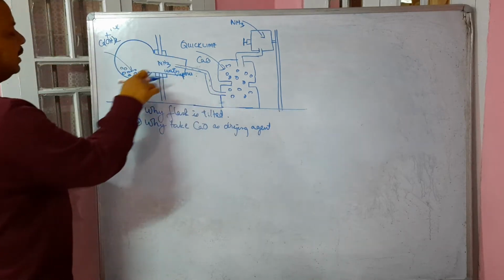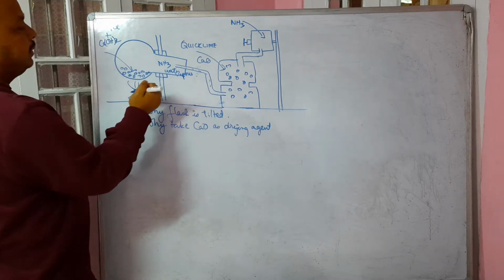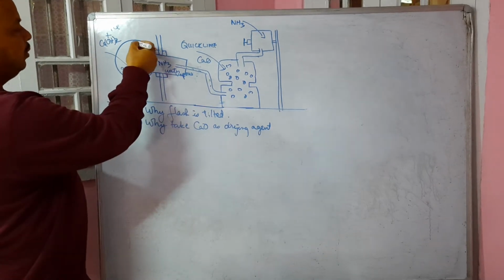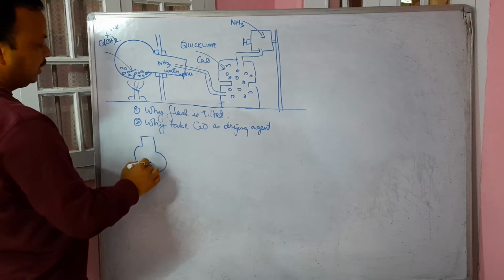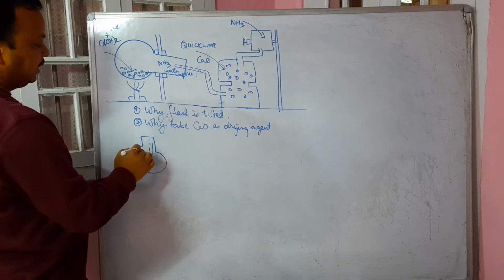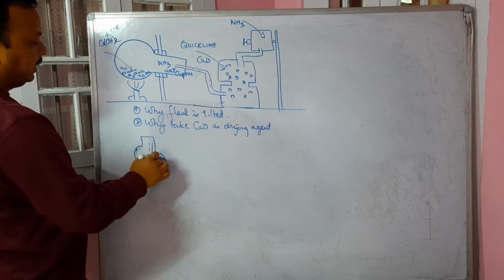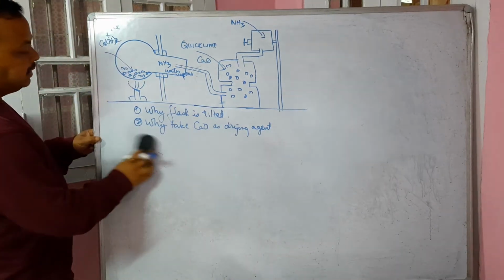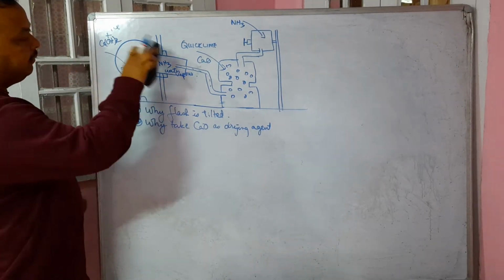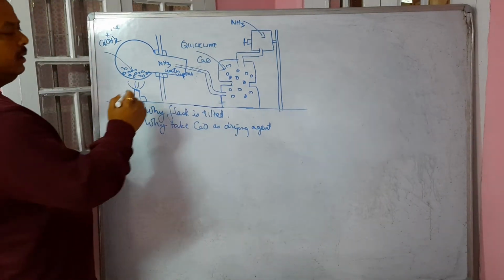Now, if this flask is straight and not tilted, the hot water vapor that is formed will again trickle down. Once the water vapor rises, it will again start trickling down the walls, the boundaries of the flask. Due to this, your flask can crack. So that is the reason that we take the flask in a tilted position.